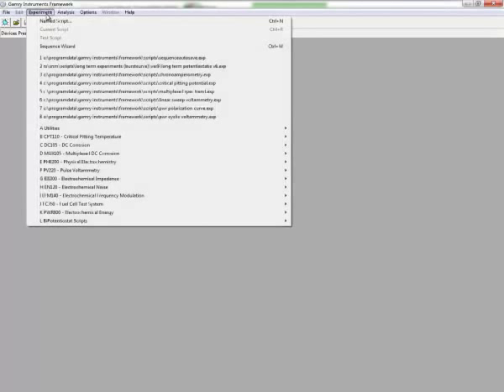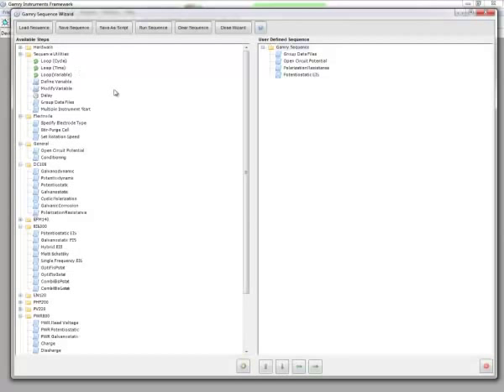The Sequence Wizard is a feature found in Framework. You click on the Experiment menu, you click on the Sequence Wizard, and it loads it up.